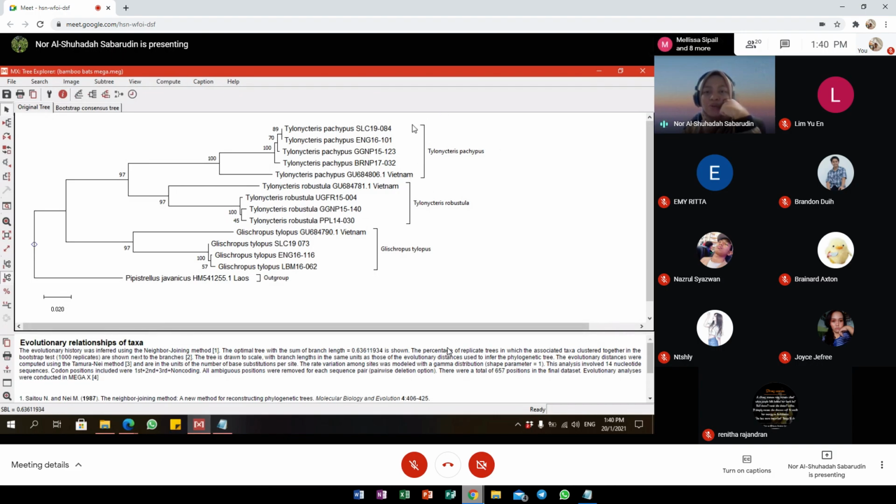This is the reason why we did all the grouping just now, so that we can see which branch is which species, which group, and we can see that the branch separating one species from other species has no problem. This is one of the results that you need to have later on.